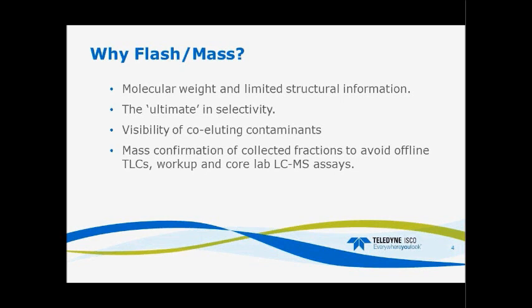One of the most common questions is why flash mass? Flash chromatography is a very simple technique. It's quick, and many times mass spectrometry is interpreted as being very complex and more research-oriented, and so it doesn't make sense on the surface to marry the two together. But the real reason to connect the two is, one, to find out the molecular weight of the compound that's eluting out of the column, and to possibly gain some information into the structure of the compound as it elutes from the column.